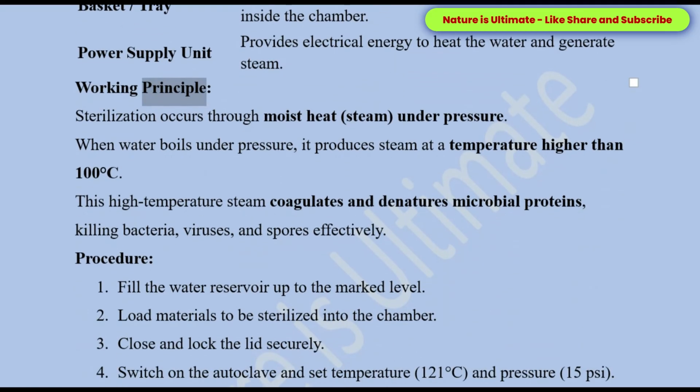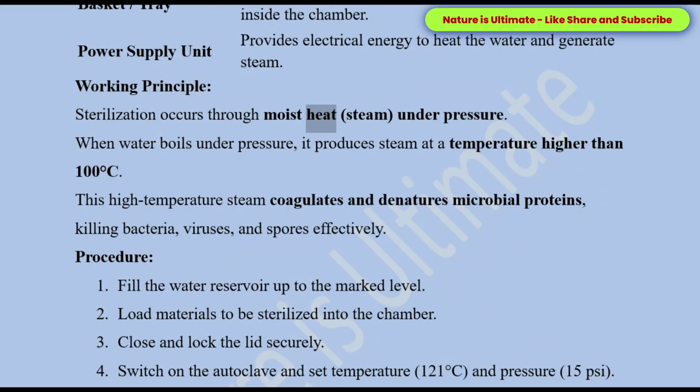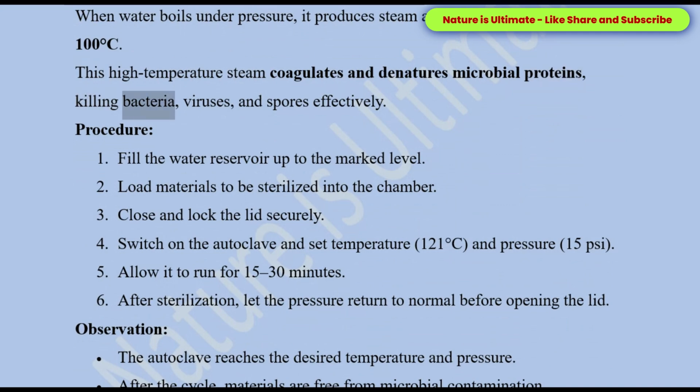Working principle: Sterilization occurs through moist heat, steam, under pressure. When water boils under pressure, it produces steam at a temperature higher than 100 degrees Celsius. This high-temperature steam coagulates and denatures microbial proteins, killing bacteria, viruses, and spores effectively.